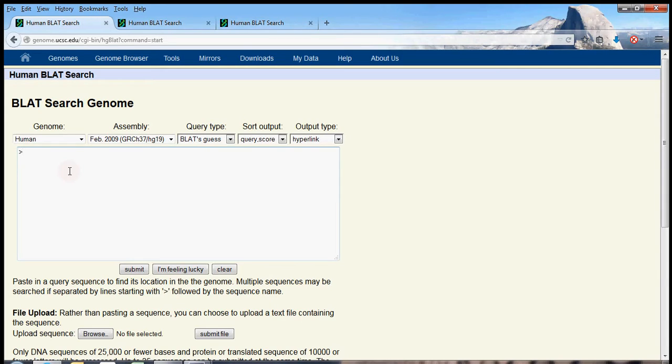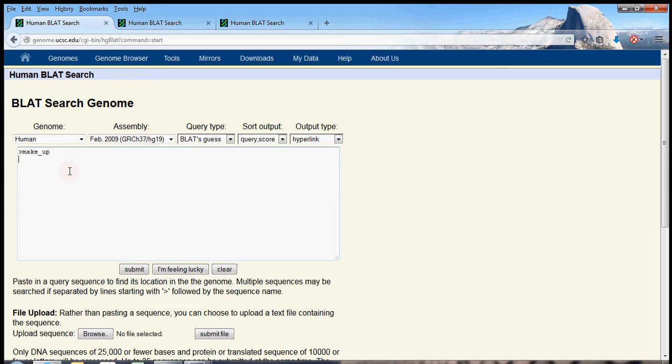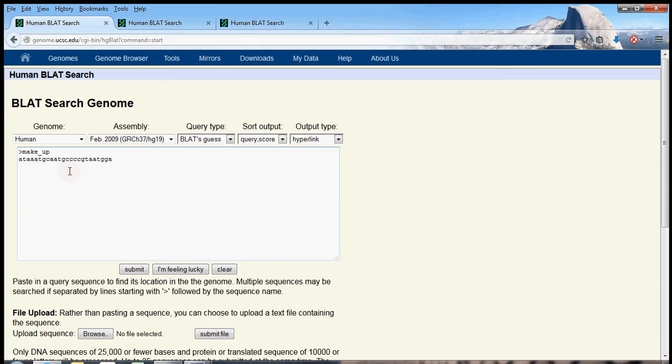So what would happen if I searched for a sequence that I'm just going to make up? This is called the FASTA format, by the way. I start off with a greater than sign, name of my sequence, and then I'm just going to start writing letters. Which letters? Well, A-T, A-A-A, T-G-C, A-A-T-G-C. I'm just making these up, and maybe BLAT will find it in the human genome. Let's see. C-C-C-G-T-A, A-T-G-T-A. What do you think will happen? I don't know.